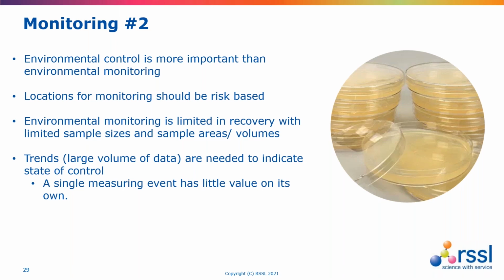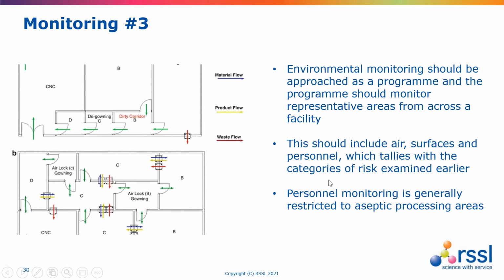So this places a great deal more emphasis upon trend analysis. And unless we're doing aseptic processing and specific batch release, then a single measure is of little value. We need to look at the big picture, which is important. And we should also approach the environmental monitoring as something that's systematic and is an active program.